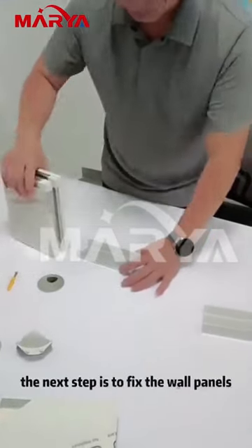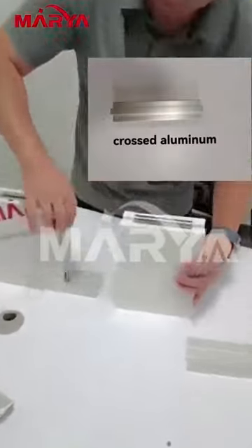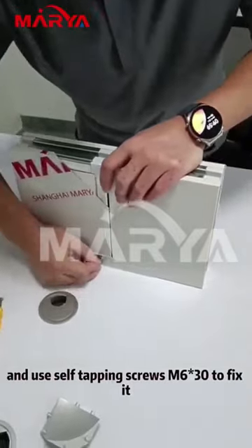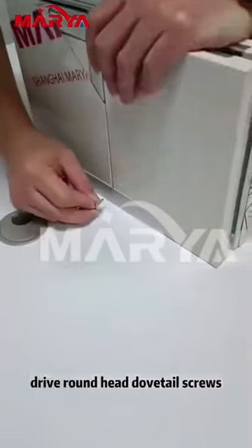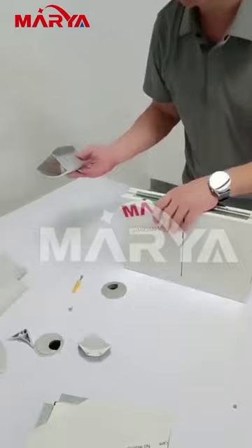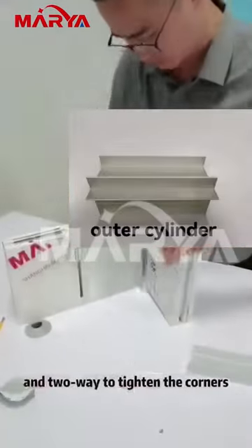The next step is to fix the wall panels. Snap the wall panel into the aluminum track and use self-tapping screws M6*30 to fix it. Drive round-head dovetail screws on each corner of the wall panel and then use the outer cylinder and two-way to tighten the corners.